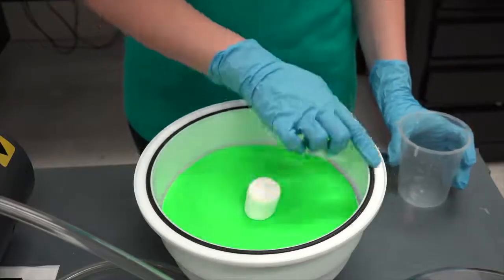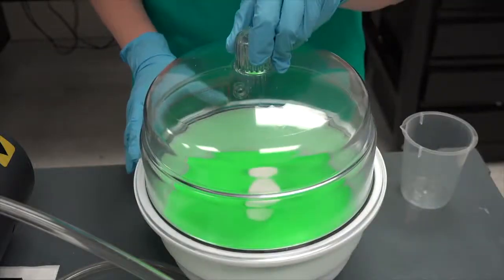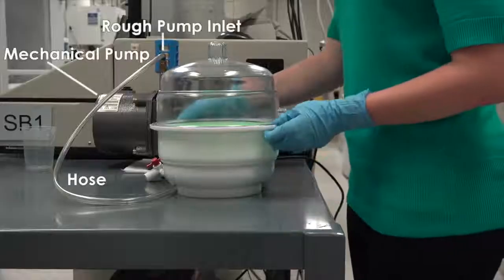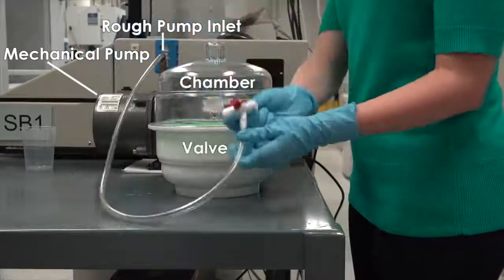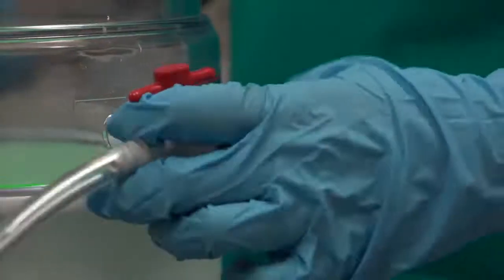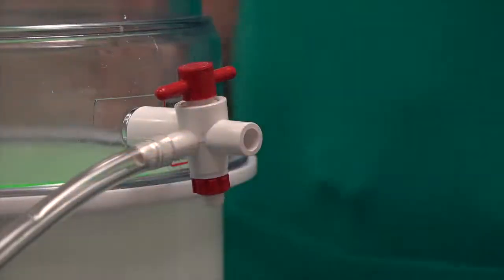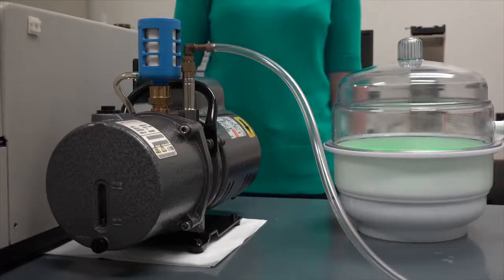Here is the O-ring gasket that seals the chamber. First, let's connect the input of the mechanical pump to a small vacuum chamber. Next, let's turn on the pump and proceed to evacuate the chamber.